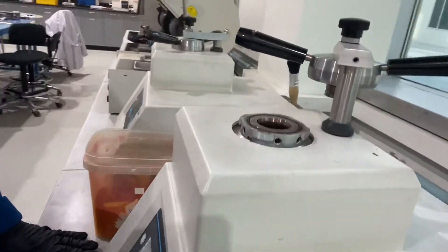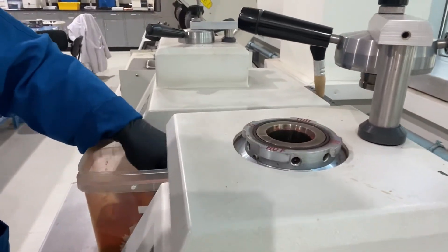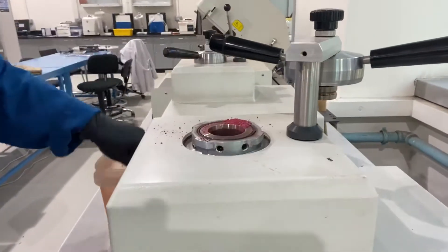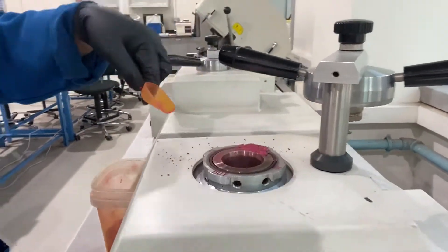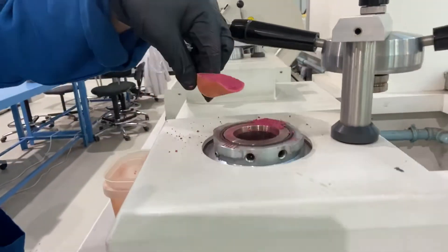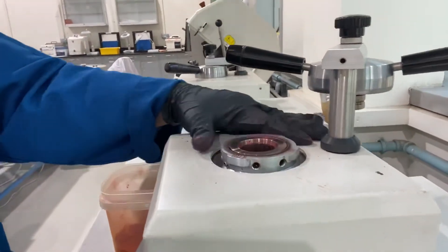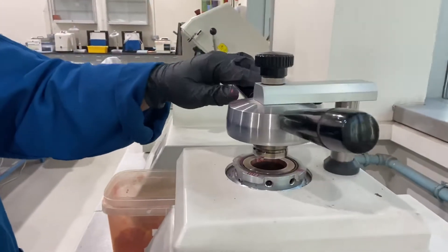As soon as the piston ram is in the bottom, load three scoops of the phenolic powder, remove the excess powder, and close the top cover.